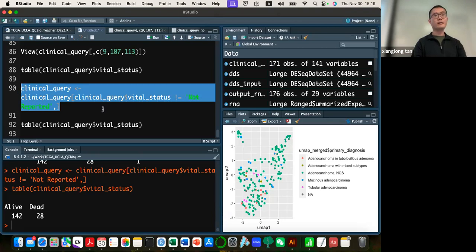This one, right? Yeah. So let me check. Typically, maybe due to a typo or separation.